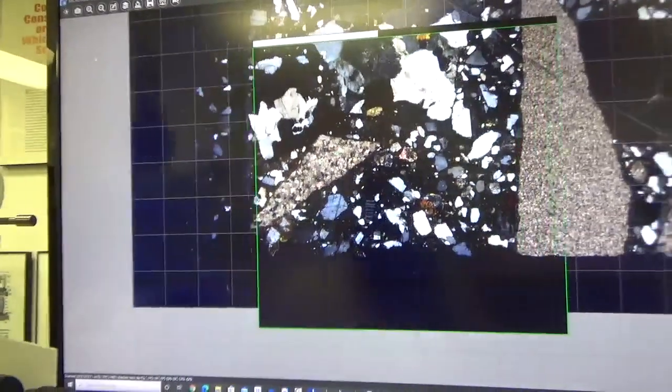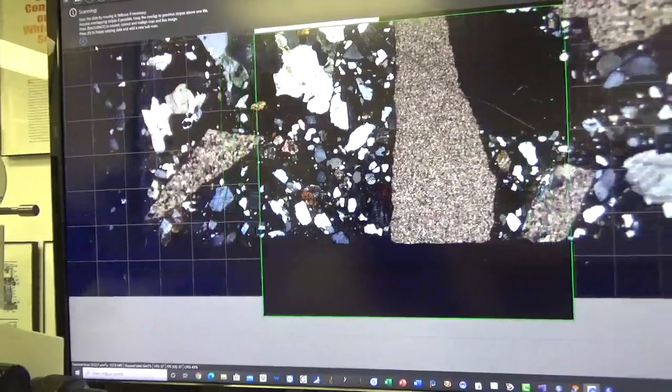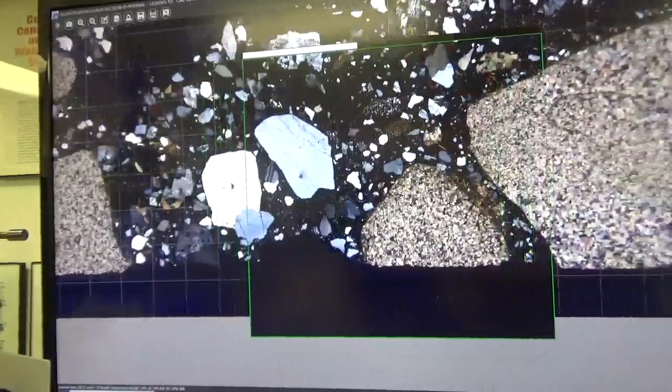That's how I used to do it, by stitching multiple images, but now I just scan, because during the scanning I can concentrate more on what I am seeing and keep a record in my brain of the aggregate, the paste, the carbonation, the air content, air void distribution, paste density, porosity, distribution of paste, coating, how many coating layers I have, and what kind of mineral fillers are present in the coating.